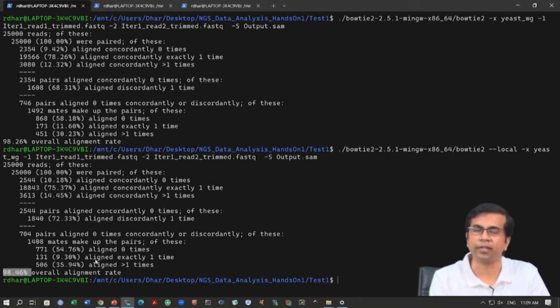So, we have done this pre-processing step, and we have trimmed the data already, and we have seen the quality score is pretty good in the beginning, and at the end they are not really bad for this data. If we had low quality scores at the end or at the beginning, we might see more improvement in this alignment rate. And this will be clear if we now try to run this using the original data where the data is not trimmed. Because if the data is not trimmed, the program will have a hard time finding proper alignment for some of the reads, where the adapter is still there.